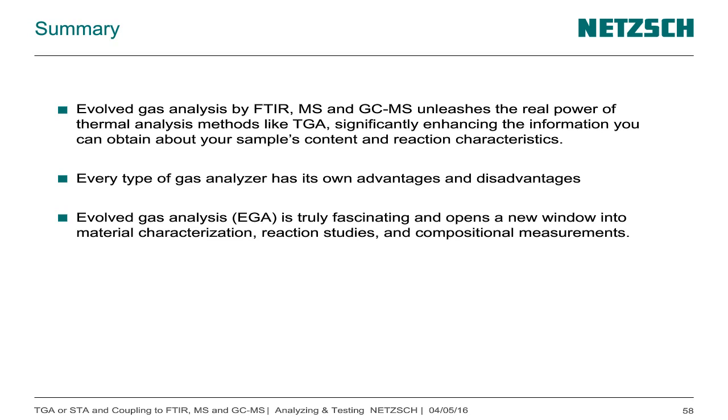What you should do, if you have a thermal desorber with a material in a tube, let's say for organics, normally I would use Tenax, and you put it at the outlet of your TGA or STA, and then later take it to the thermal desorber. Otherwise the people who own the GC and the thermal desorber stop being your friends, because if you take the whole amount of gas on the thermal desorber with all the dirt, you will see a lot of dirt afterwards in the GC.